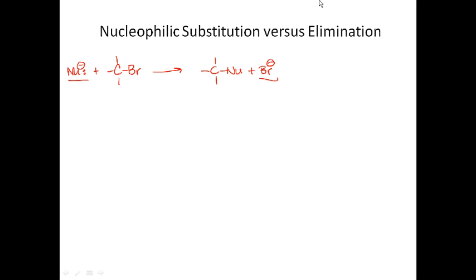This is called nucleophilic substitution because I'm substituting one nucleophile and generating another one as a product. So in this experiment, we will be taking an OH group, and in essence, we're going to be substituting that OH group for a Br. Now, the mechanism's a little bit more difficult than this, but we're going to be substituting the OH group for the bromine, so it is a nucleophilic substitution reaction. Only it'll require an additional reagent in order to have the OH group be substituted.